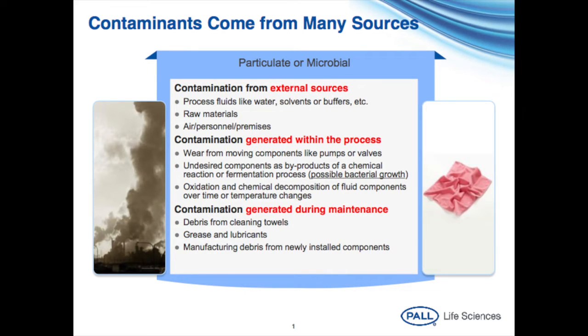First, the microfluidizer and processing pathways like tubing and hold vessels must be clean and contaminant-free. In our early work with the Squalane nanoemulsion, we learned that even a cleaned laboratory microfluidizer can generate a solution with a bacterial load if that cleaning is not robust and filtration directly out of the unit was not employed. A key concept we should all understand: emulsion, and especially nutrient-rich emulsion solutions, require pre-filtration directly out of microfluidizers.